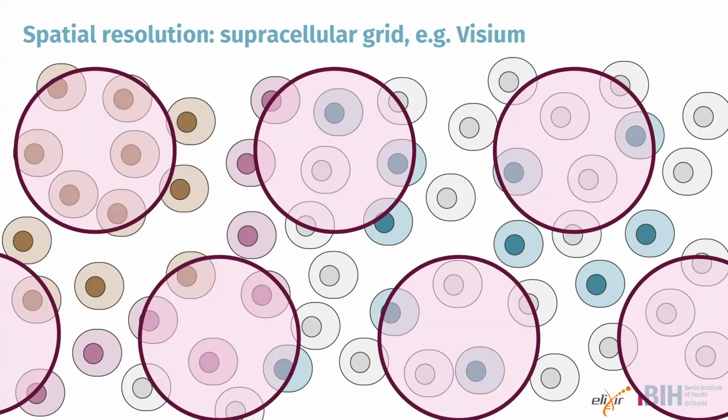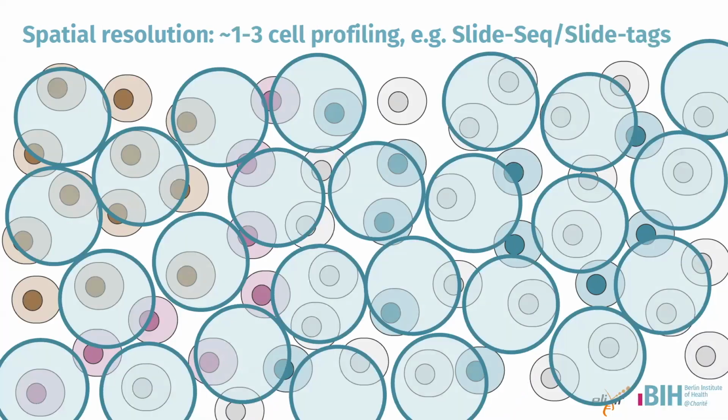The most popular technology is Visium. And I like showing this slide because it really tells you what you're measuring, right? So this is really an underrepresentation of the density of cells that you would get. So you can really appreciate that in each one of these spots, the task of figuring out the gene expression is not trivial. It's not that you get a mix of cells, you also get partial bits of cells as well.